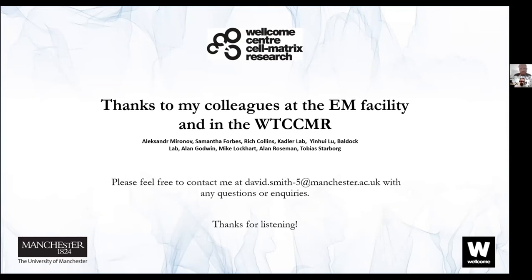It also means you don't need very heavily stained samples, as for standard serial block face imaging, so we can probably at some point use archival EM samples, but not in our arrangement, because we don't have focal charge compensation. But if you get a new machine, at some point this will improve imaging a lot.